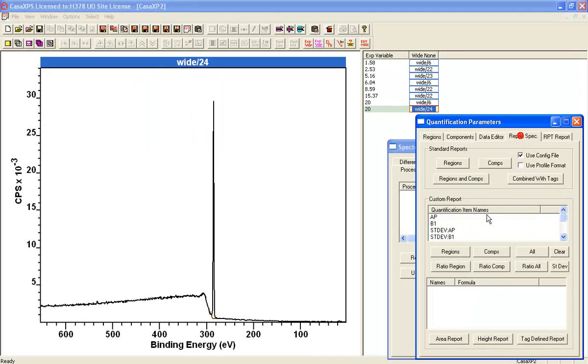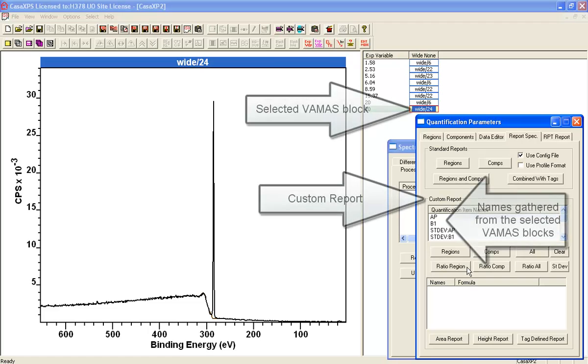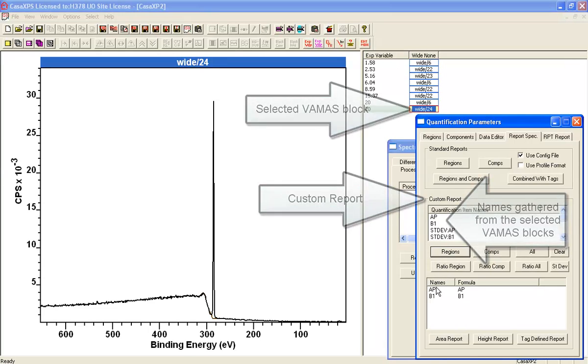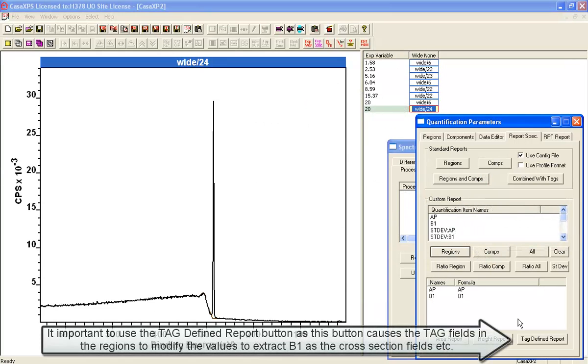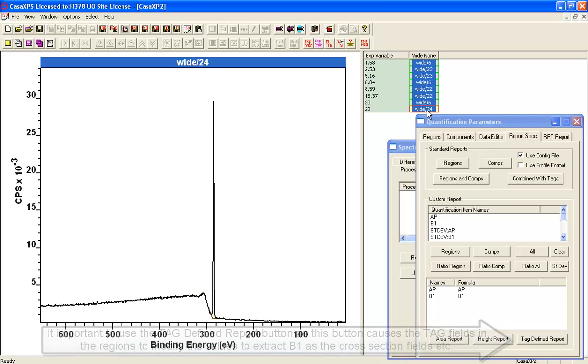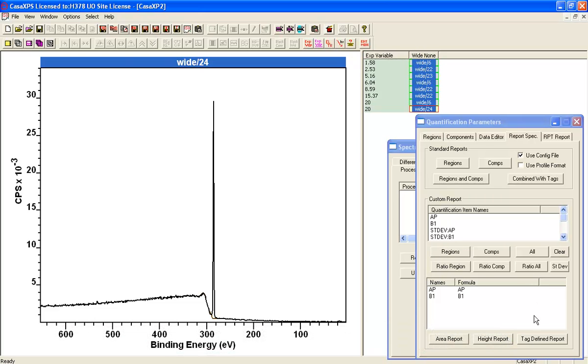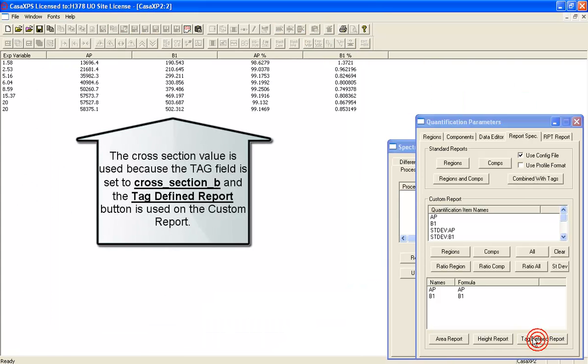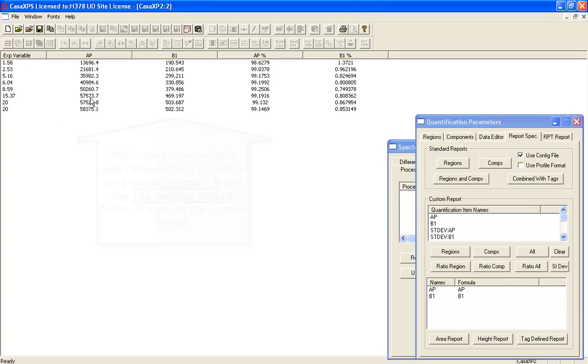So if we go to the custom report and I ask for the regions, it's going to give me these two values here. So AP and B1. And if I press tag, when I get them selected here in the right hand side, if I press tag defined report, I will get a table of the AP values and the B1 values from these data.